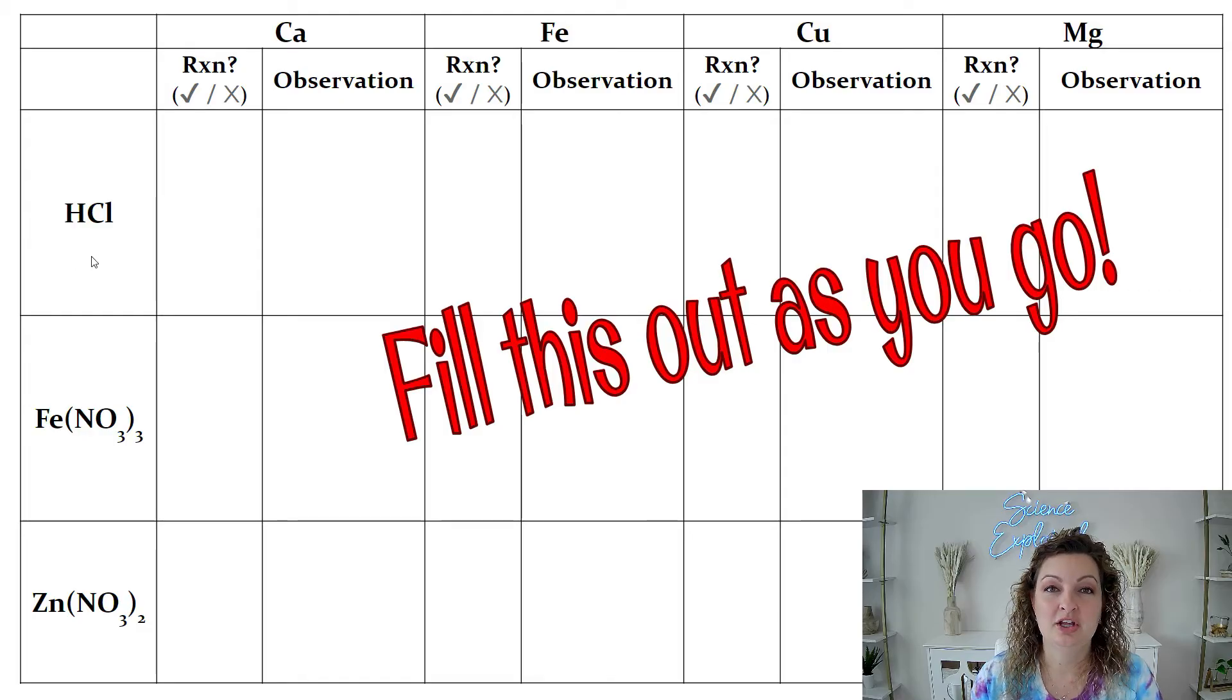So we're going to add three different liquids on top of these, different chemicals: hydrochloric acid, ferric nitrate, and zinc nitrate.